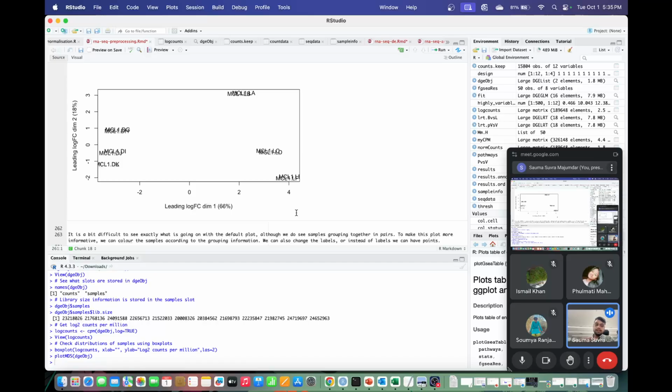Now, if you have batch effect in your data, say variation that arises due to technicalities of the sequencing and not due to differences in gene expression, what will happen is this. You have two replicates for each condition, right? For each condition these two replicates should cluster together. For example, here are the two replicates, and here are the two replicates, so these are clustering together.